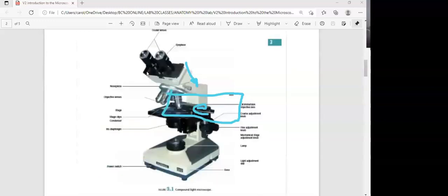So we scroll down right here. Let me see, we have right there, focusing of the microscope. Okay, so in this case, you're going to get some slides, and there you're going to have a letter E. This is basically for students to begin to practice with a microscope, right? Because imagine that this is the E like that, and the lens is in here.